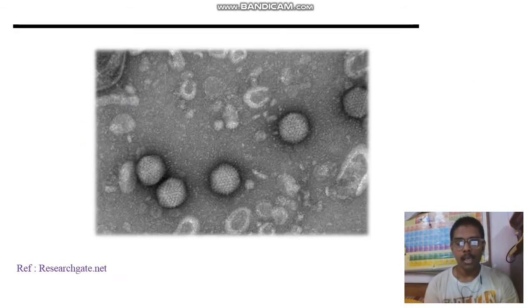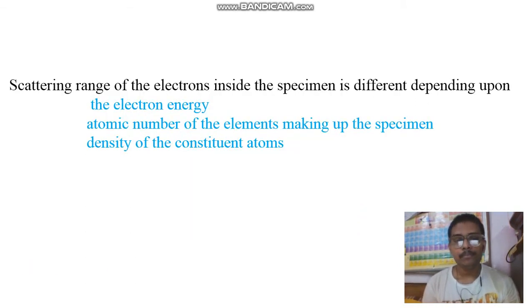Now, as the name suggests, electron microscopy means electrons are going to interact with your material. When an electron interacts with the material, it will create, unlike light microscopy, a black and white image, and that is normally created by contrast formation. Whenever you are getting a black and white image, it seems bad, as you are not getting a colored image.